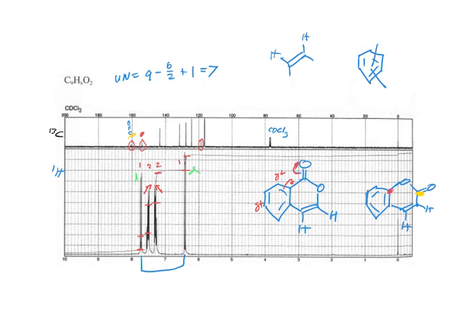Those double bond protons are so far apart because it has this conjugation. Alpha beta unsaturated carbonyls generally have the protons far apart because they have very different electron environments. If this pulls electron density this way, this pulls it this way, so this position is delta plus. So the beta position is always more downfield. In this case, I think the effect becomes compounded because we have this oxygen here, and it can actually donate electrons over this way, building up delta minus here. So those two protons end up being very far apart.